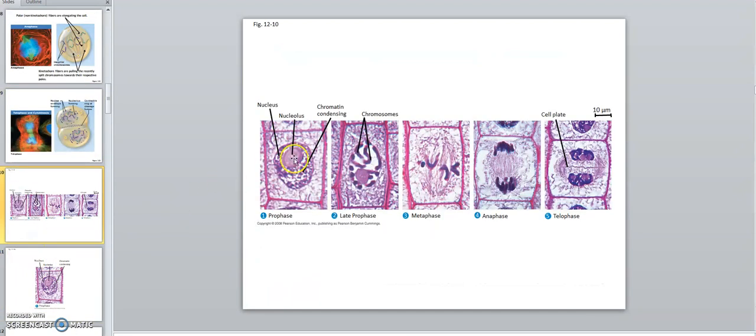Read through everything. Okay? Read through. For example, right here, prophase. The genetic material is starting to coil, but that's early. Late prophase, it starts to look like chromosomes. See, right now, it's loop domain. Coils to become chromosomes. Then the mitotic apparatus helps it move into the center. Then the mitotic apparatus helps it to pull apart in anaphase. And then here you redo what you did in prophase, put the nuclear membrane, all that stuff back around. And then this is telophase with some cytokinesis.